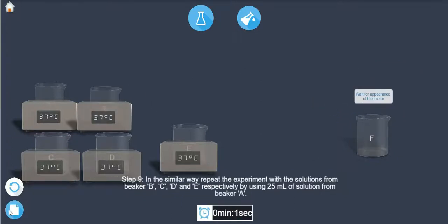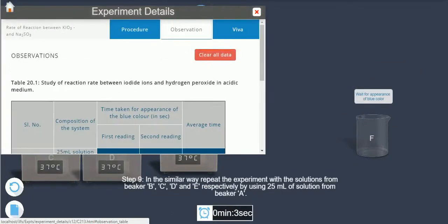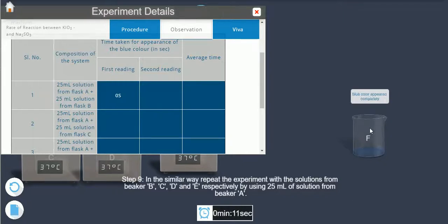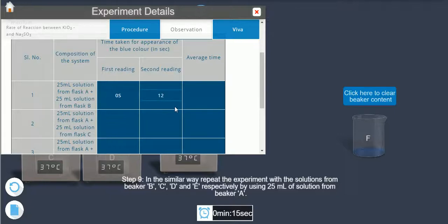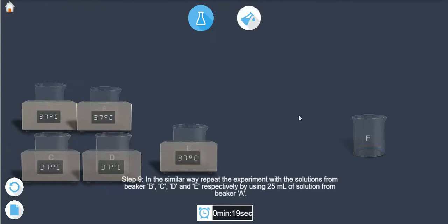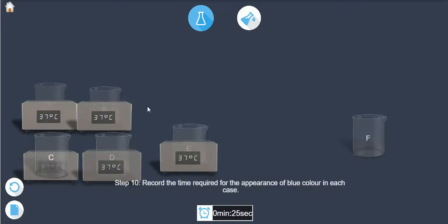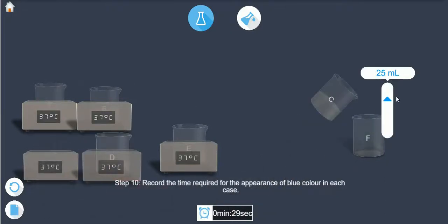In the similar way, repeat the experiment with the solutions from beakers C, D, and E respectively, using 25 ml of solution from beaker A each time. Note the initial time required for the appearance of blue color in each case.